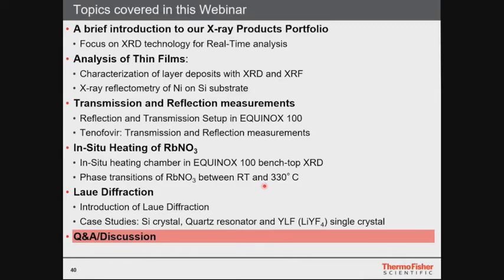If you have both K-alpha and K-beta radiation, you get three different sets of signals, which makes it tough to evaluate the data, even if there are many reflections. So you want to reduce this number. You can use a filter, but then you get artifacts of the absorption edges of the material which is used as a filter, and you reduce the intensity.